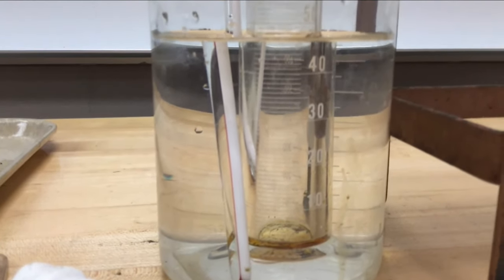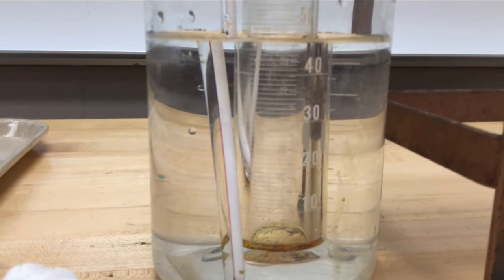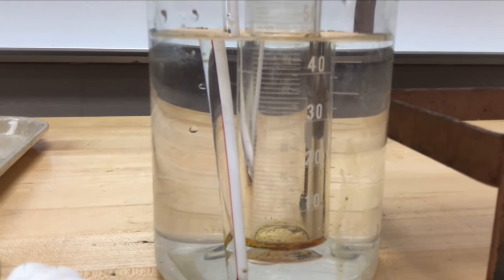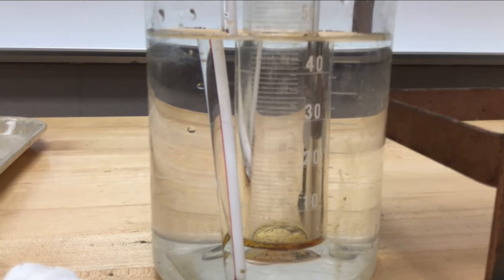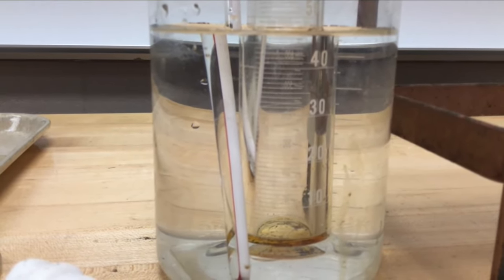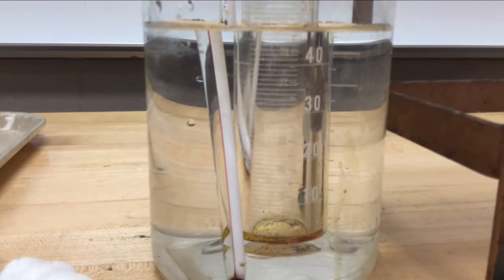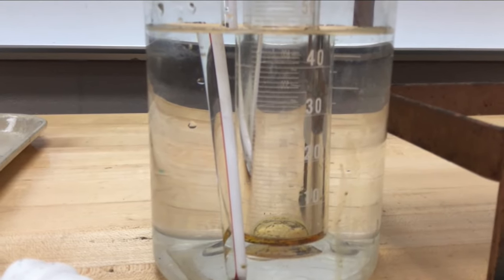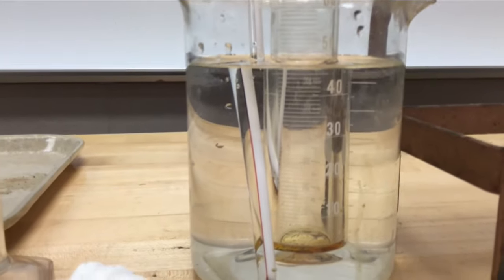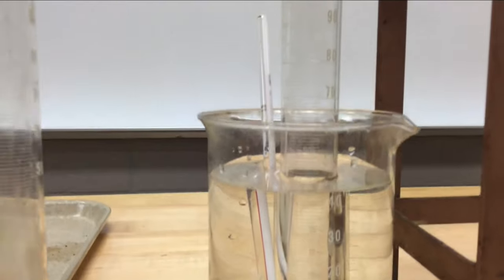My guess is that we don't have a lot of gasoline in this particular sample, that we're going to get a pretty small amount of gasoline, because all the light ends have evaporated off pretty much. Again, we didn't get our first drip until 190 degrees. So we'll take this up to maybe somewhere a little bit above 300 degrees, and then we'll switch over and start collecting diesel fuel. Oop, there's another drip. Again, we've got it going very slowly right now.